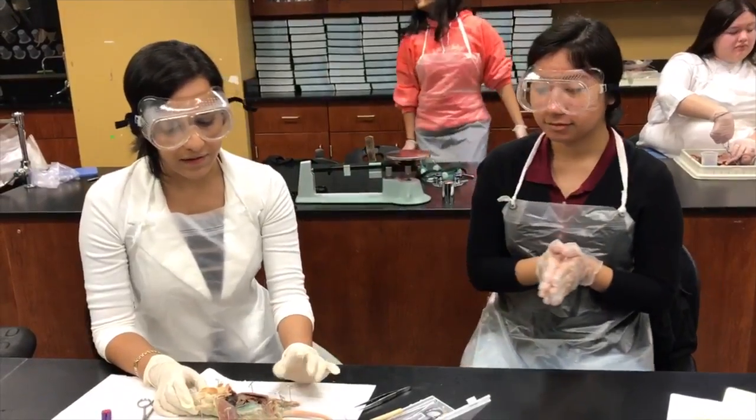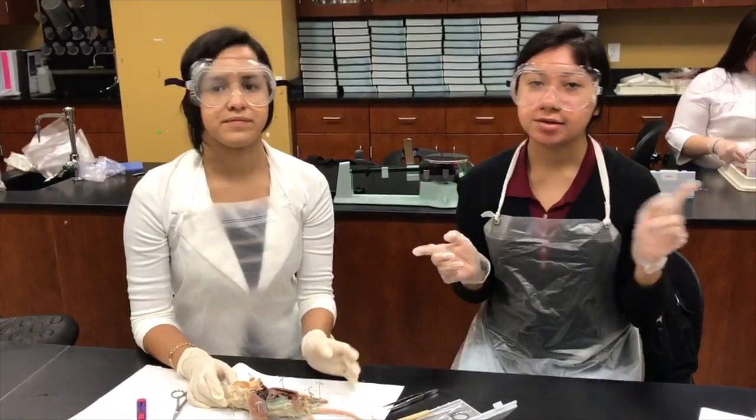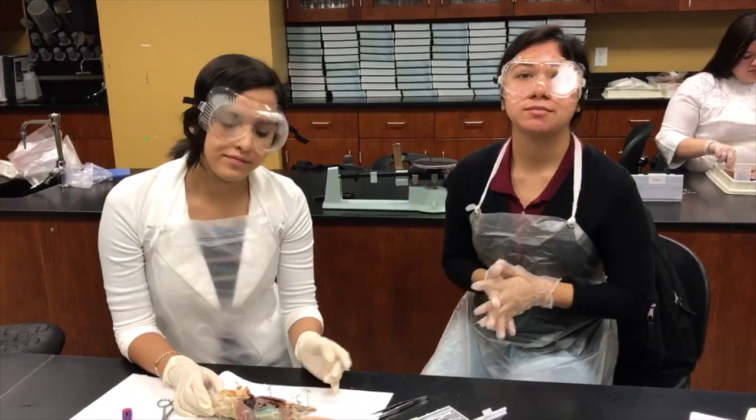The purpose of this lab is to dissect the digestive system of a female rat. We will be identifying the structures of the digestive system and their functions.